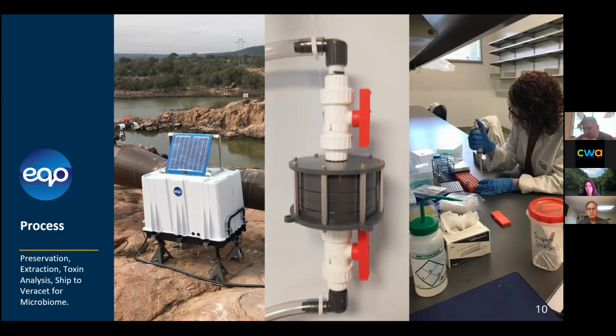And it has to be utilized in a lab to be done effectively or with any level of cost, because the robotics involved in doing this in the environment are quite beyond us as far as being financially viable. So we have to utilize it in the lab and have experts work on the RNA, just because it's very difficult to work with. It's a finicky molecule. You look at it funny, it falls apart.